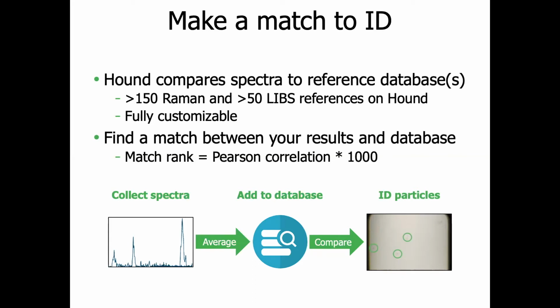If you have run a measurement with a specific database and want to match your spectra with a different database at a later time point, you can do that also using our analysis software without having to rerun the measurement.